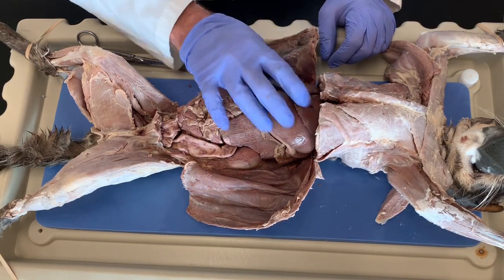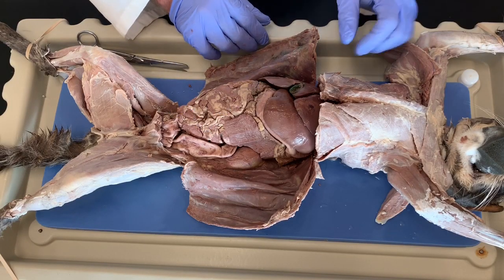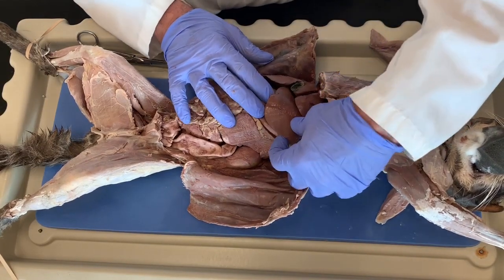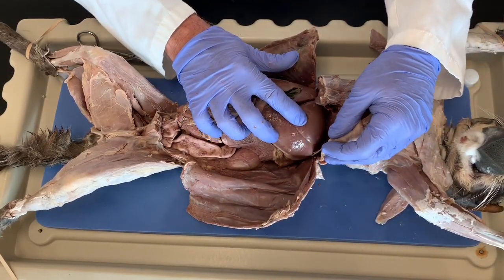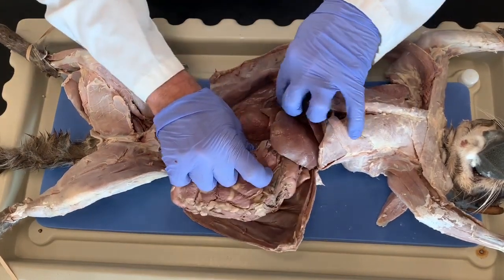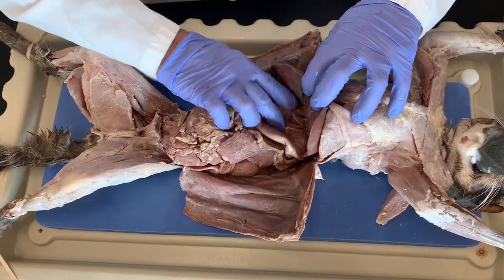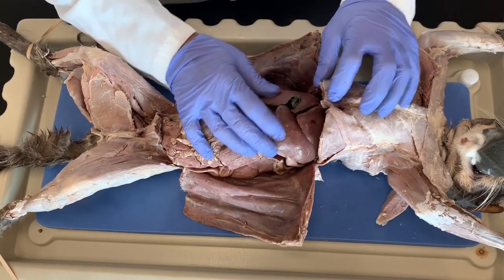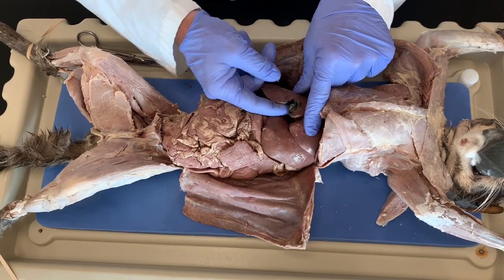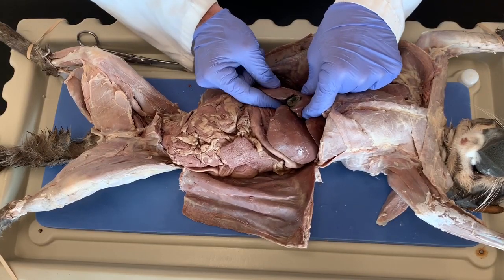Here, these structures right here is the liver, and there's actually 5 liver lobes to the cat. Okay, this is the cat's left, right? So this is gonna be the left lateral liver lobe. This is the left medial, right lateral down here, and then the caudate lobe is underneath right there, okay? And then we know this is the right medial liver lobe because of this structure right here, which is the gallbladder, okay? The gallbladder is kind of encapsulated by the liver.